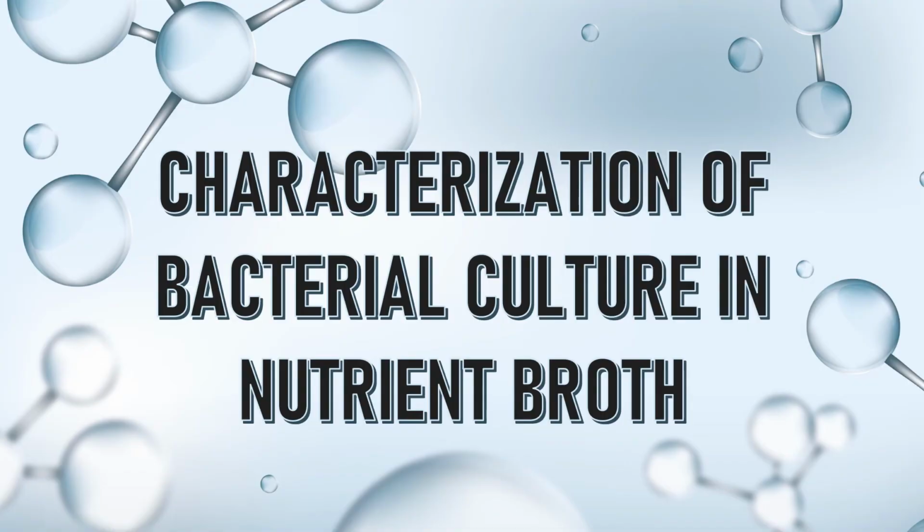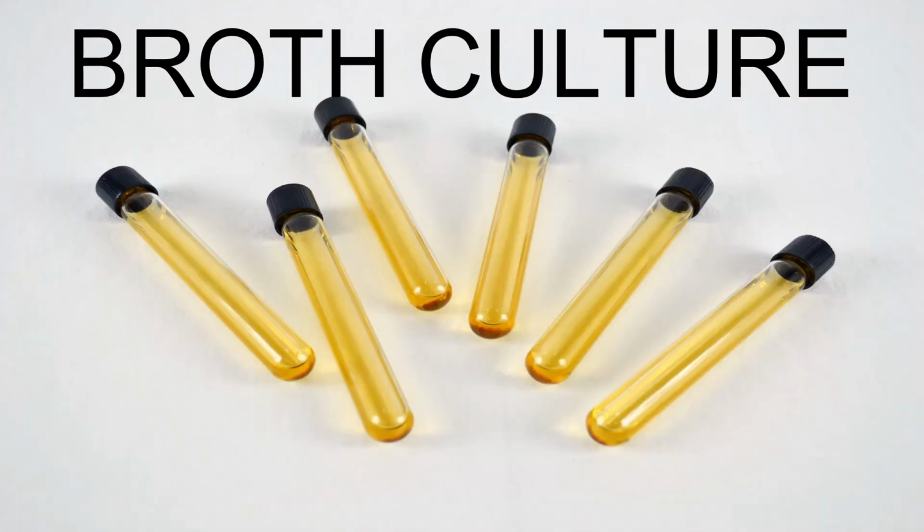Characterization of bacterial culture in nutrient broth. Broth cultures are liquid cultures used to grow bacteria in laboratories. To create a broth culture, a scientist begins with a sterile liquid growth medium. The medium is inoculated with bacteria and placed in an incubator at the appropriate temperature. After a certain amount of time has passed, the broth becomes cloudy from the increased number of microbes.